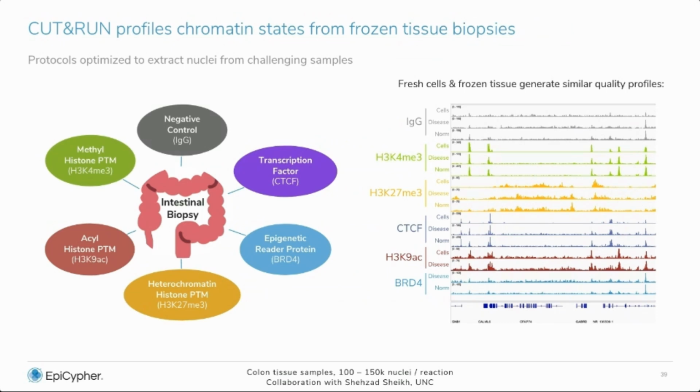So I told you about how automated cut and run can be used to enable consortium scale genomics, and in a specific application where you want to fingerprint, you want to find unique signatures associated with different cells. But another potential application of auto cut and run is looking at biomarker discovery.